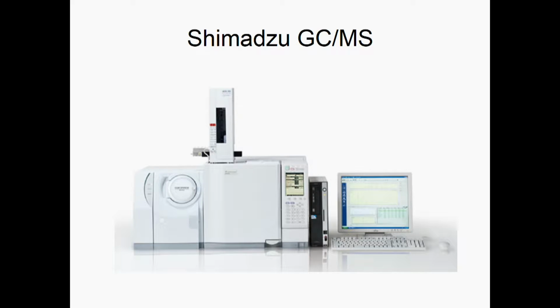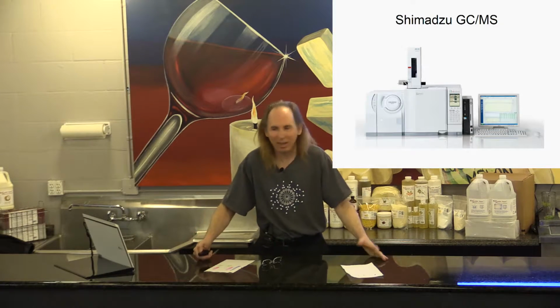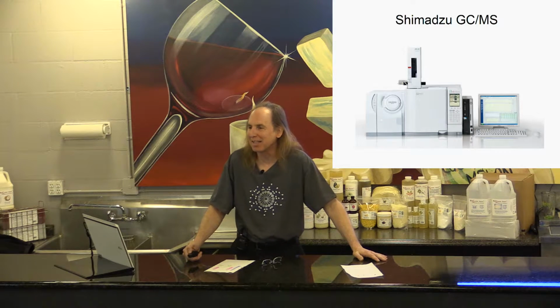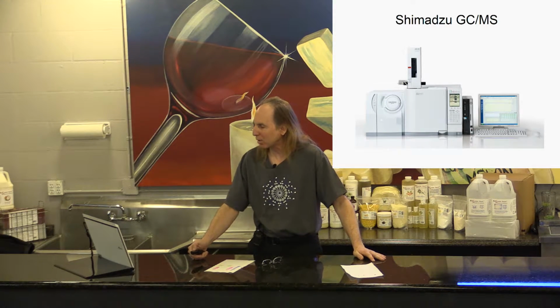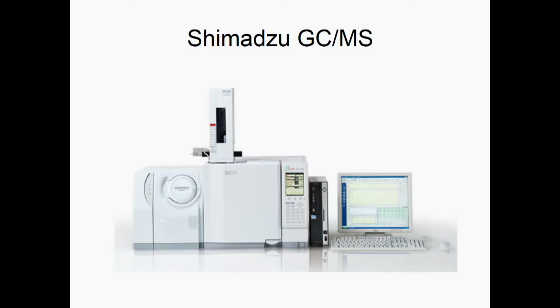This is our GC, it's a GC mass spec. I'll talk about the mass spec later, but you've probably seen this if you ever watch NCIS. It's not just that Abby has a GC mass spec, it has a name, major mass spec, and not only that, we have the same one. It is the same model that Abby uses on NCIS. It's very noticeable because it has that circle there on the left. When I saw it, I thought, ha, that's the one we have. So on the right is the GC, on the left is the mass spec, and I'll talk about those two parts separately.